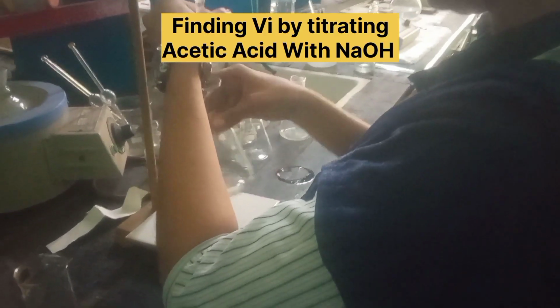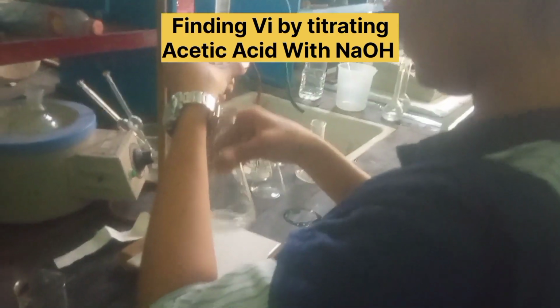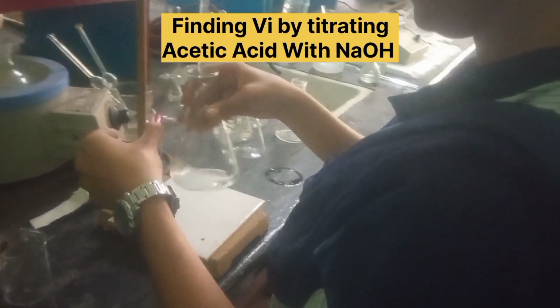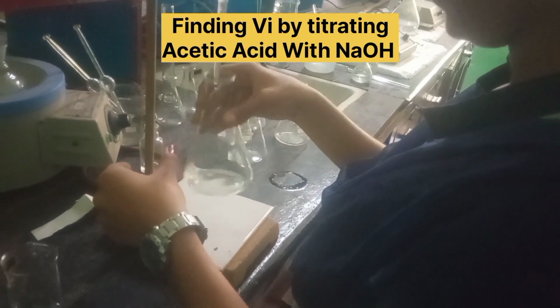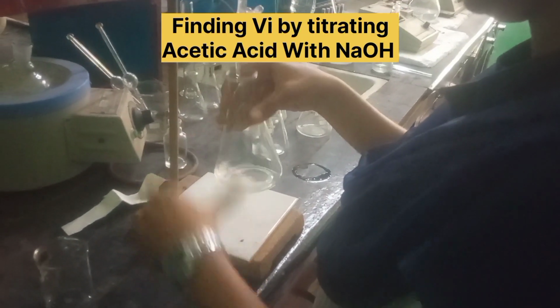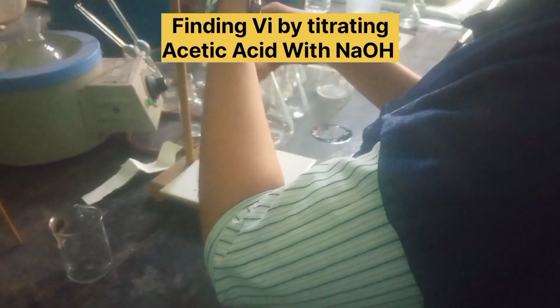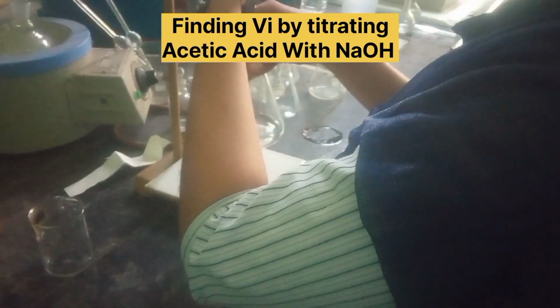So here one can see the endpoint also. After getting pink color as endpoint, the titration is to be stopped and the reading is to be noted. Here the volume of NaOH required is to be considered as Vi.